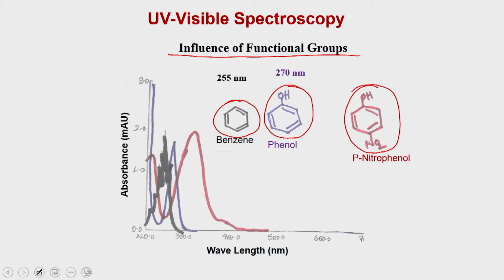If you see the absorption spectra, the black colored spectrum belongs to the benzene.